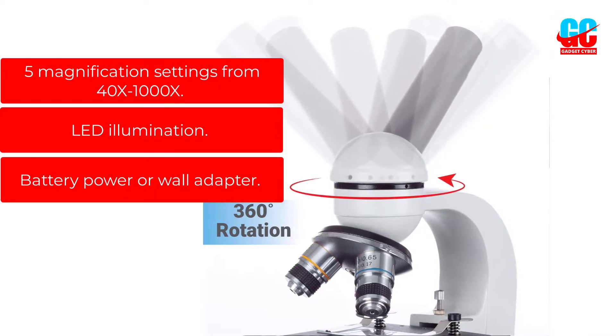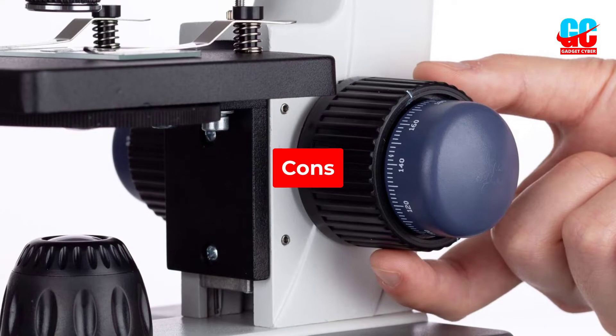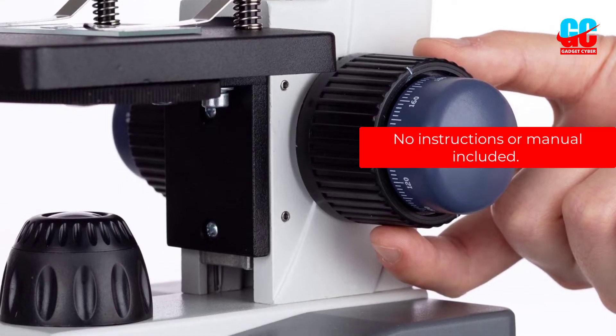LED illumination. Battery power or wall adapter. Cons: No instructions or manual included.